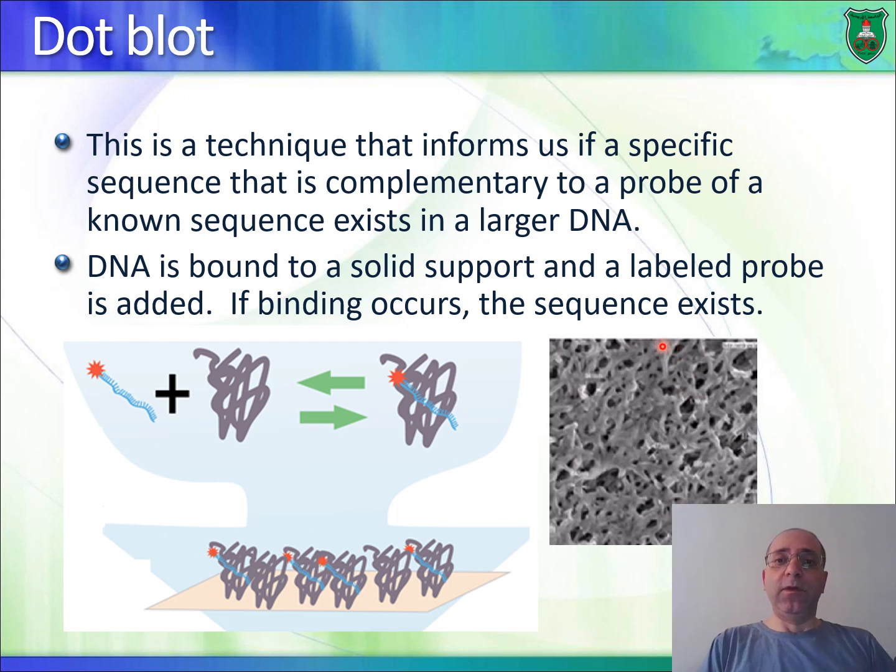So the idea here is that we add DNA to this membrane. The DNA would be embedded inside the membrane. It would stick to the membrane, it would attach to the membrane. And when we add DNA, we're adding, let's say, a single type, but many molecules, by the way. So it's not just one molecule, no, many molecules of DNA.